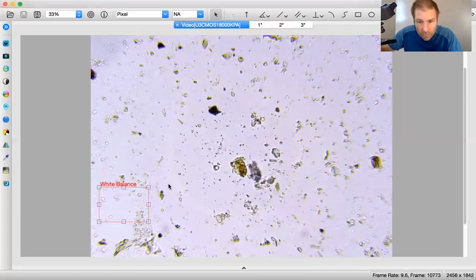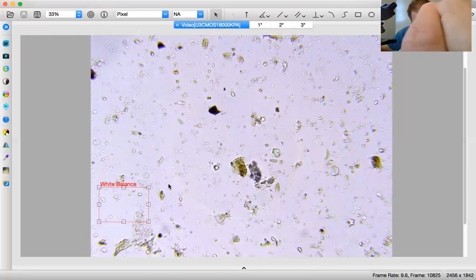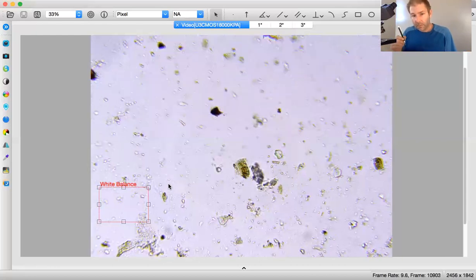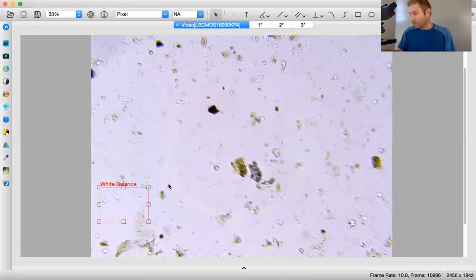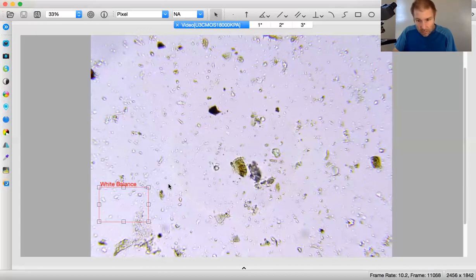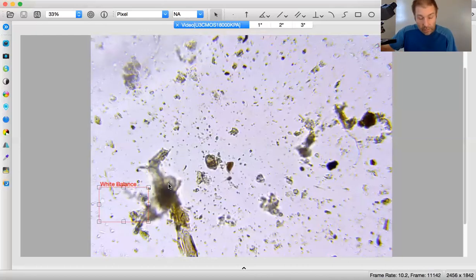So with the 2 of those again, I'm going to call that it's actually about a 1.5. So 1.5, which would be 0.15 on actino for the 4th field of view. Okay, no protozoas that I can see. No amoebas at all.